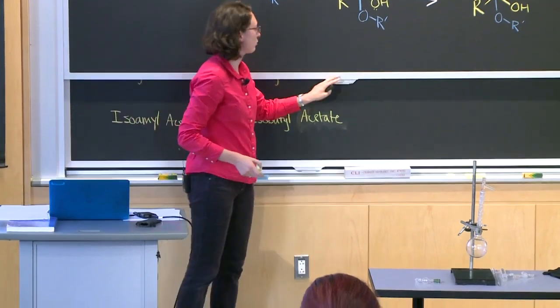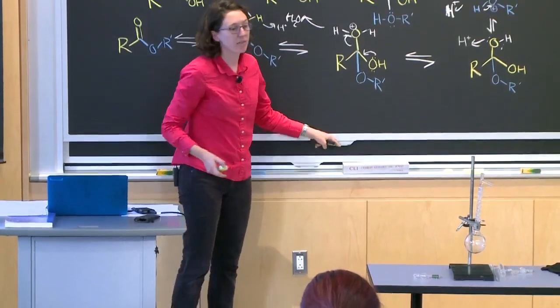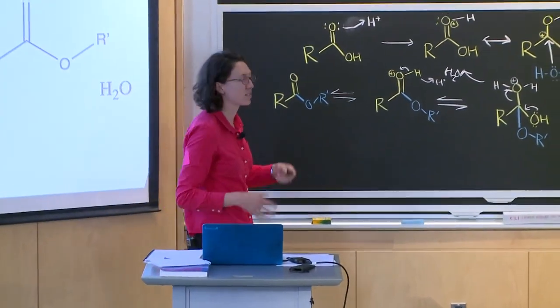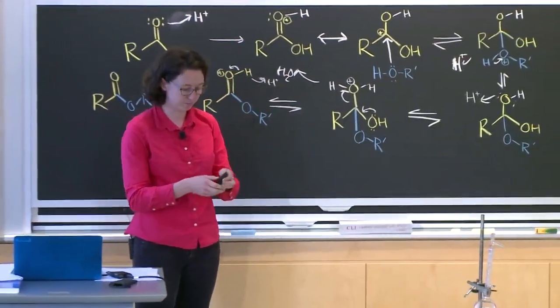So I guess we can leave this here for now. So that is the mechanism of the reaction, and like I said, you guys have probably seen that before. It's pretty straightforward, and so this is the reaction that we will be doing in the lab.